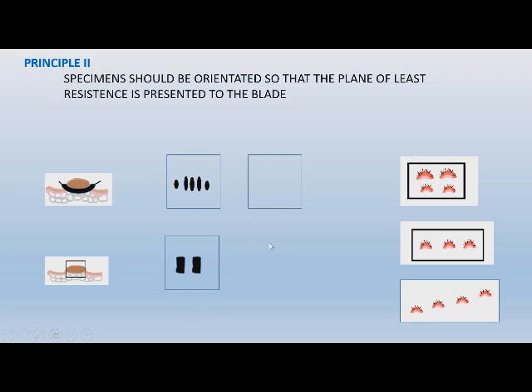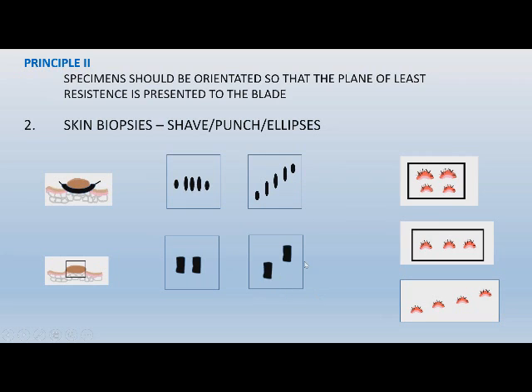because you're not giving your pathologist the best section that you possibly could. So if we do something like this with our shave biopsies, then we're not going to be hitting these entire 5 sections at one time with the possibility of peeling a piece up. We're going to softly go into these, and the resistance is going to be less. Pretty much the same with the punch biopsy, though not quite as important.